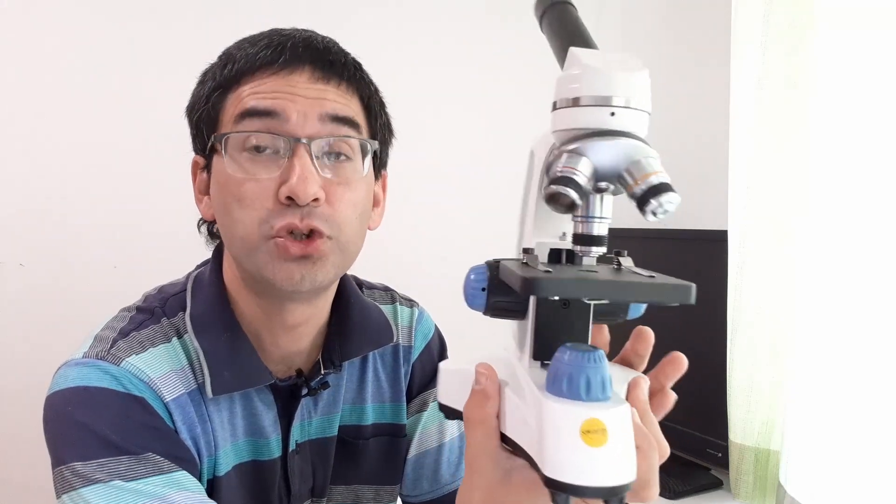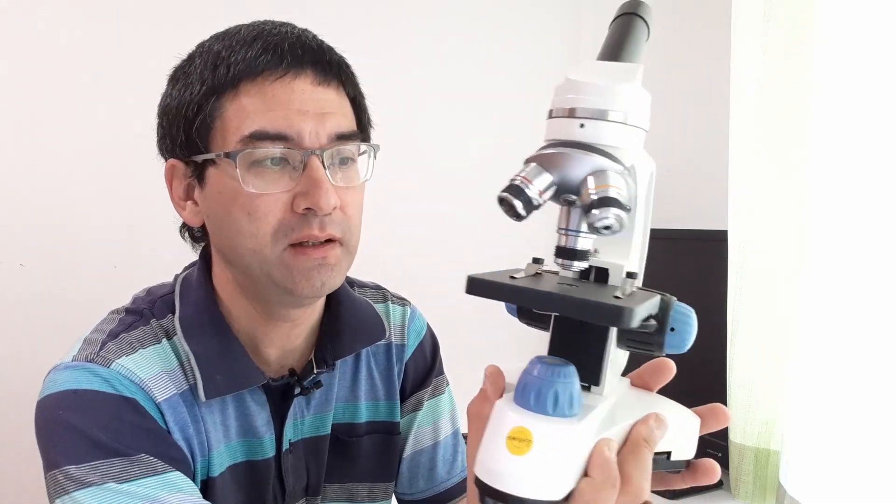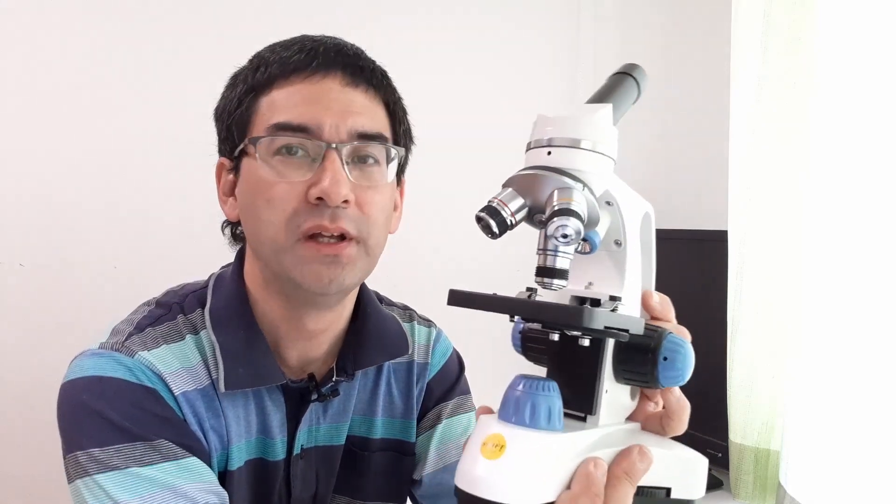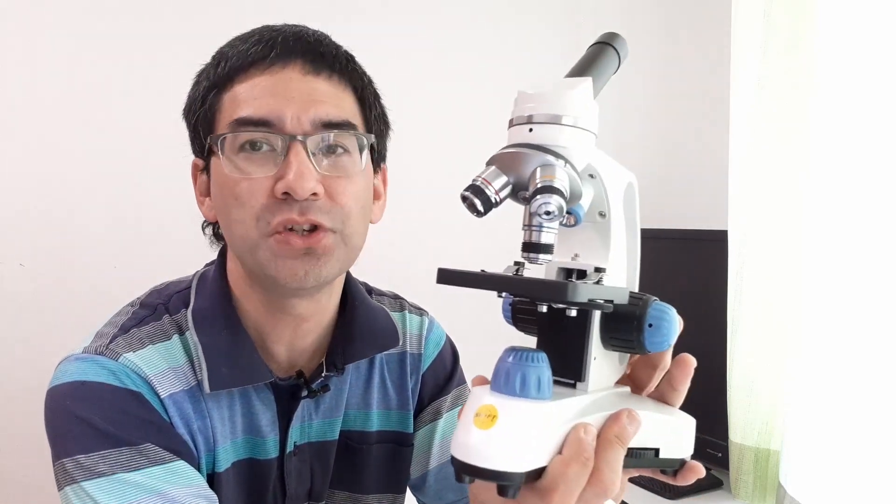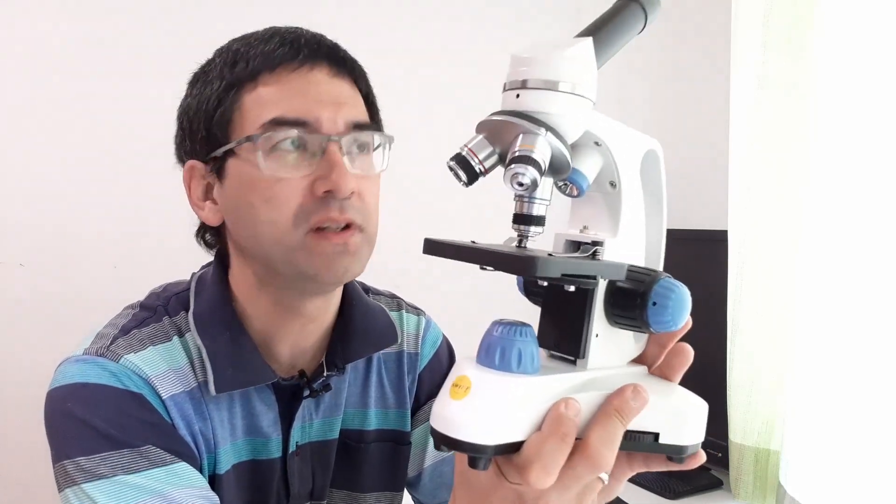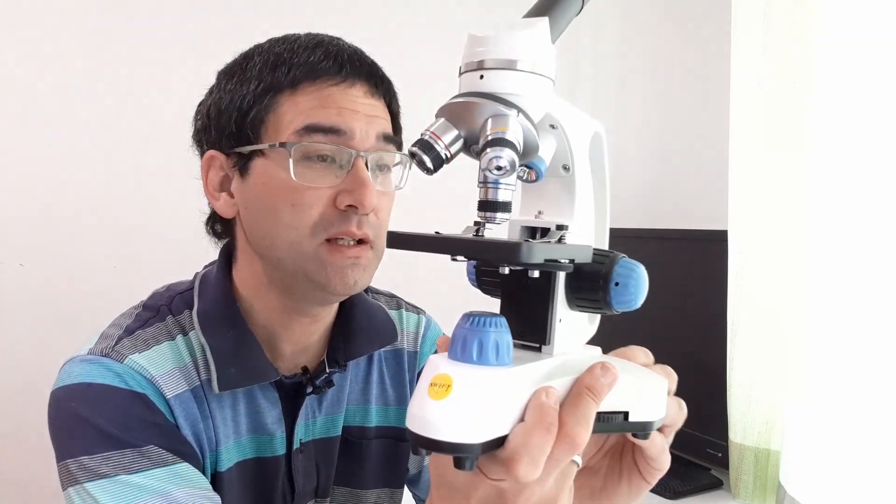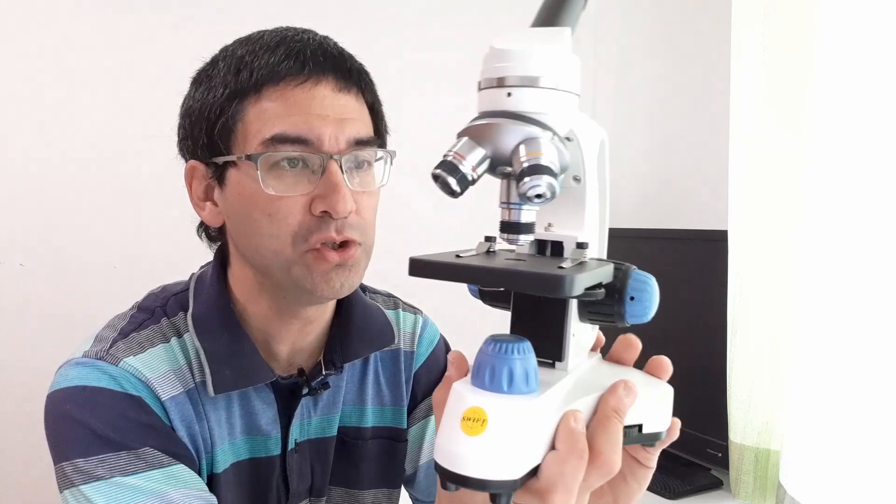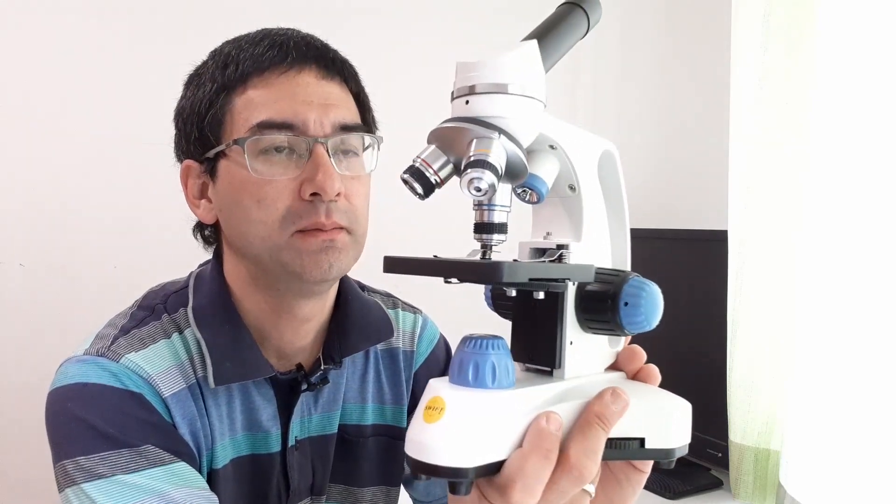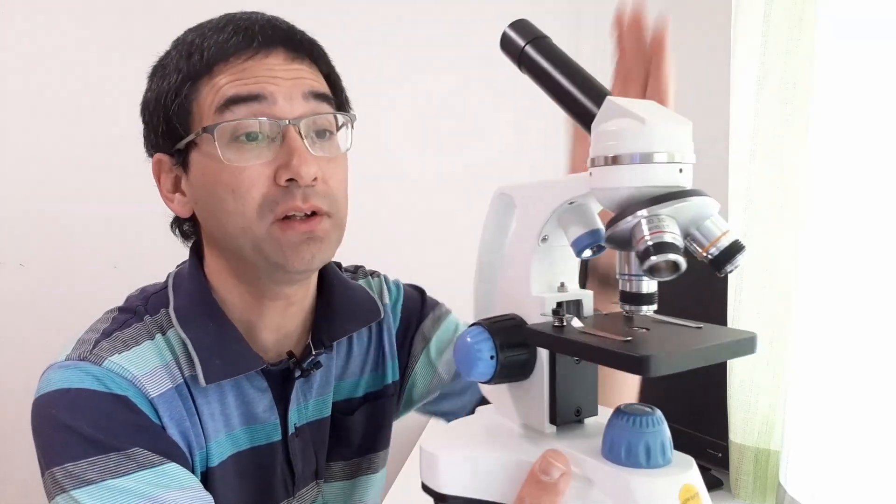Of course for children that is a possibility because it's relatively small, also low cost, and because it's reduced in functionality there is no mechanical stage, there is no condenser and so on. It can also be seen as an advantage because the children might otherwise be overwhelmed with all of those additional features. I can also imagine if you need a homeschooling microscope it could also be quite useful.